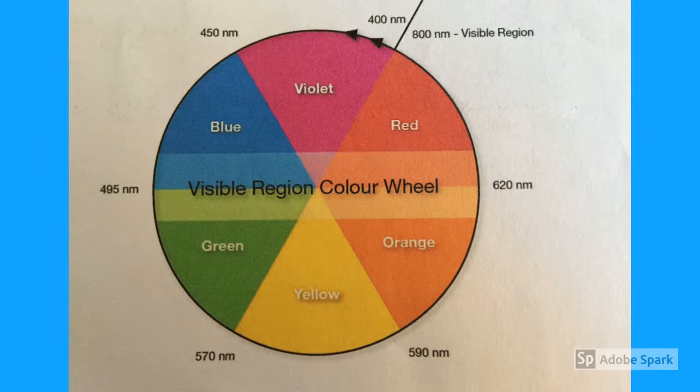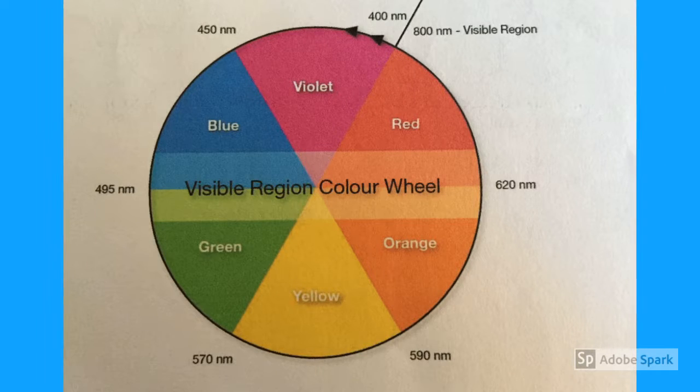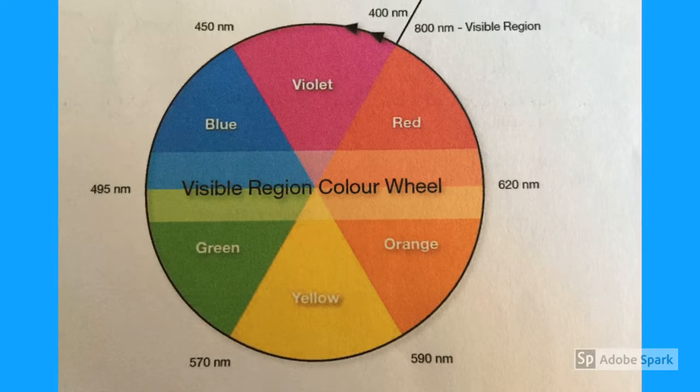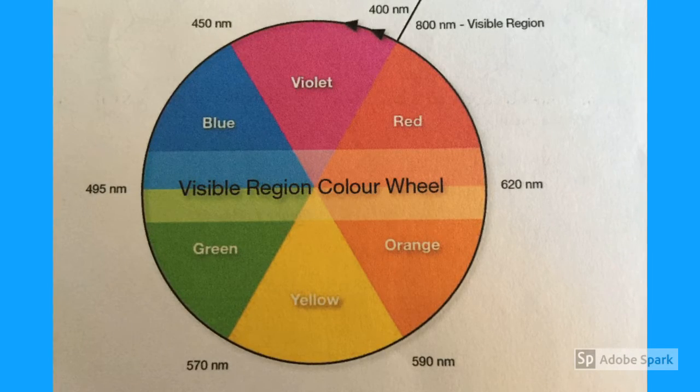If lambda max determined the observed color, then the color would have been a very red-orange, but the mixture appeared as a neon orange to us. Therefore, observed color does not determine lambda max, because if it did, lambda max would have been closer to the yellow wavelength at about 590 to 600 nanometers.